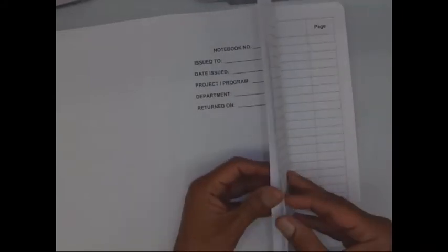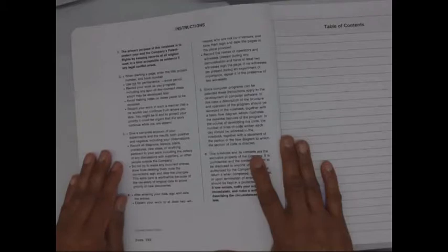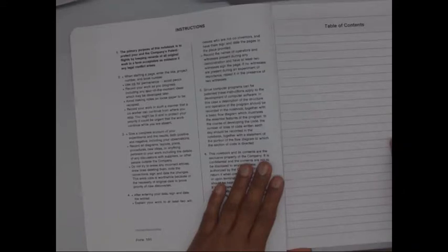Now, on the second page, you will find a series of instructions. You should read through these instructions. These instructions are generic to maintaining a lab notebook for any company or any organization. There may be mild variations specific to a particular organization, which we will be talking about in this video.